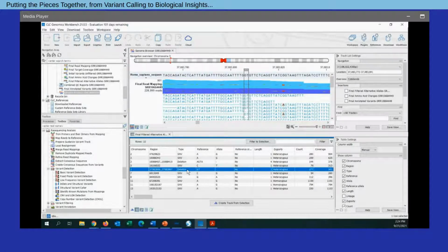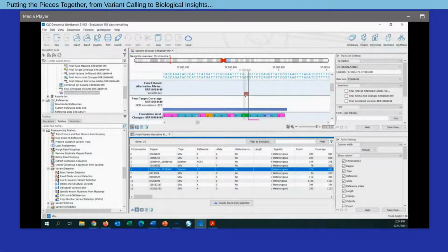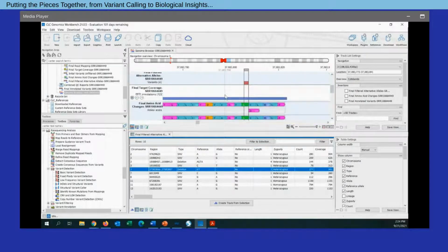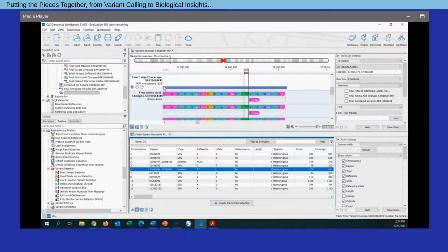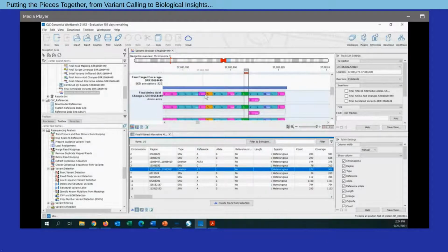As I click on that row within the table, now what I'll see is a view of the mapping at the top here that denotes coverage. I'll see positional information of the variant allele itself here. So we're dealing with the deletion of 2 nucleotides. And then as I scroll down, we can see that it's within a targeted region using this blue bar here. And then also look at the expected amino acid change based on this variant.